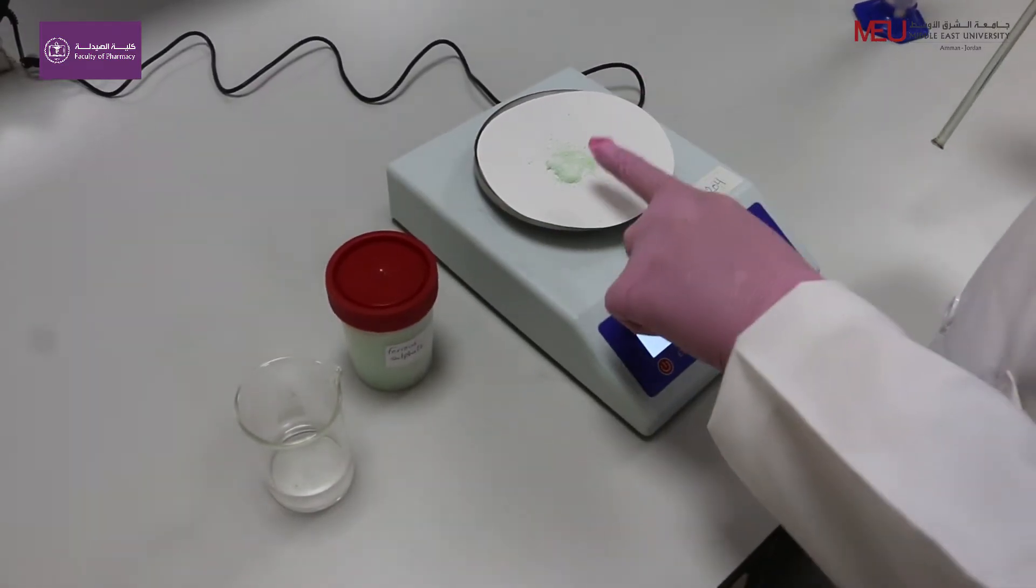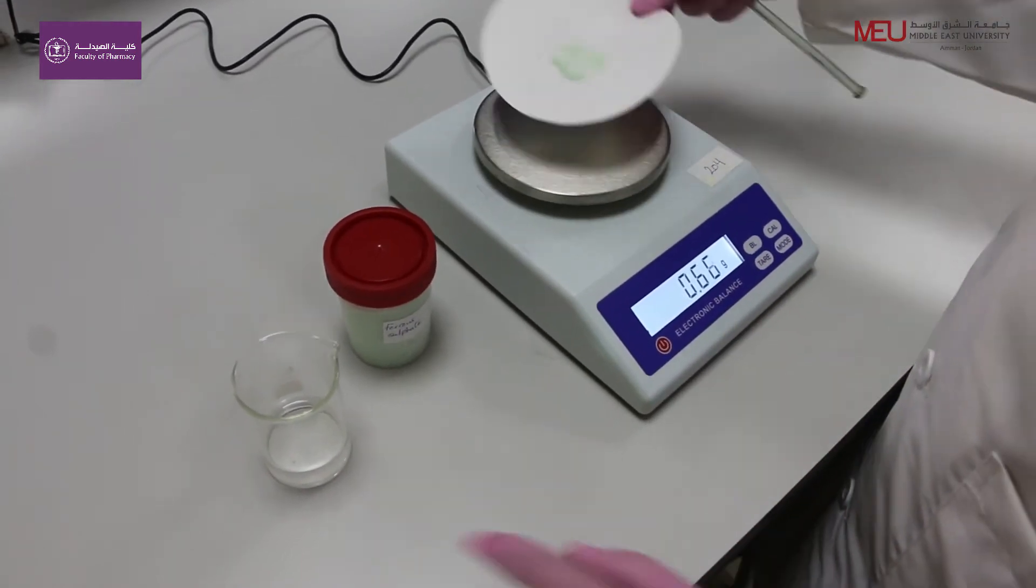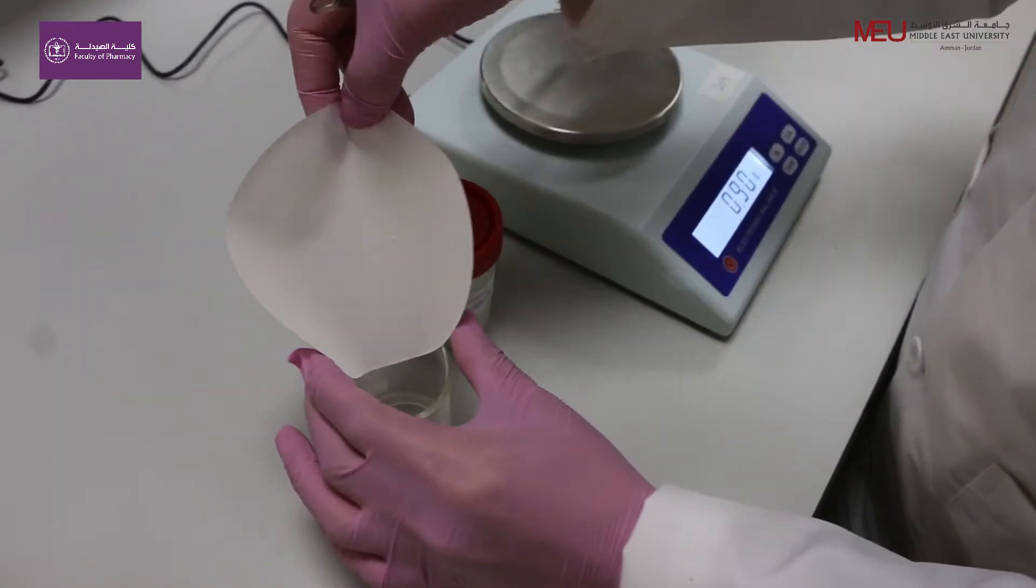Use this solution to dissolve 0.60 g of Ferrous Sulfate. Ferrous Sulfate is used as an iron supplement.